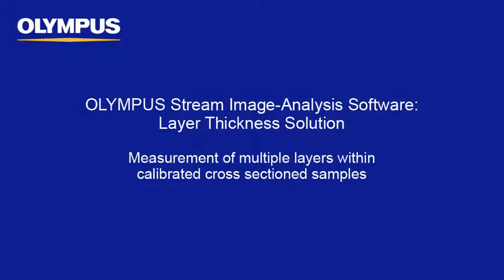This tutorial is one of many instructional videos presented by the Olympus Industrial Equipment Group. This tutorial video will provide you with detailed instructions to perform layer thickness measurements on cross-section samples within the Olympus Stream Image Analysis software.